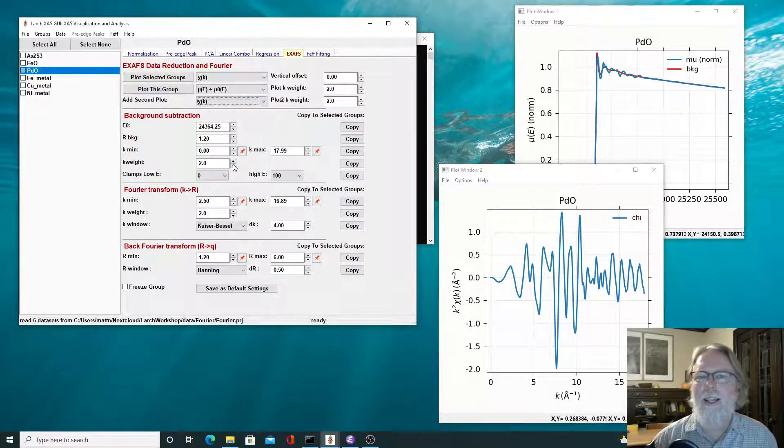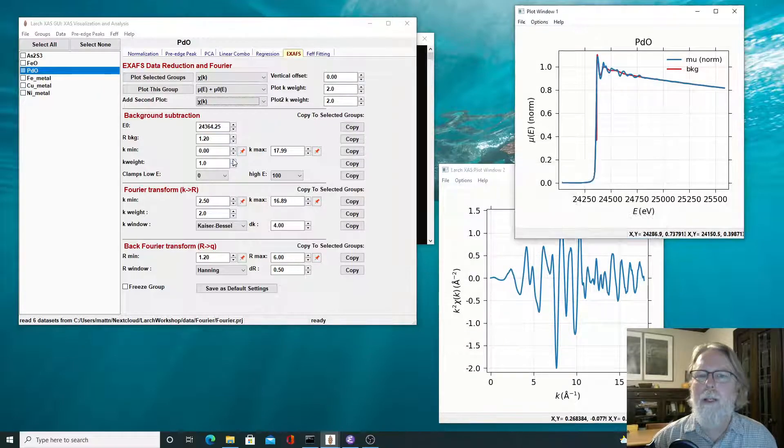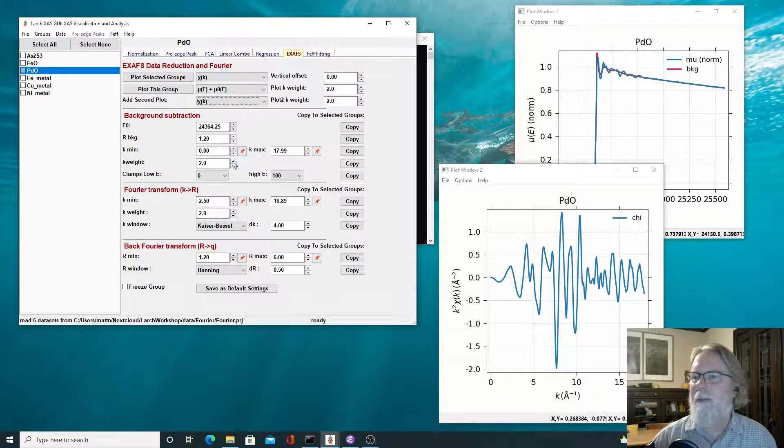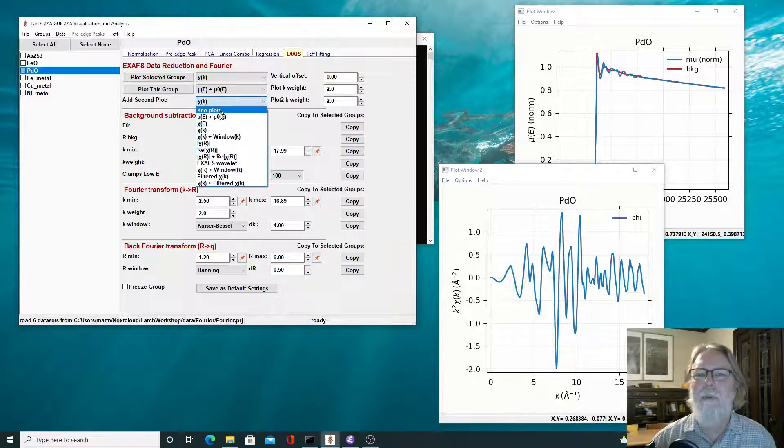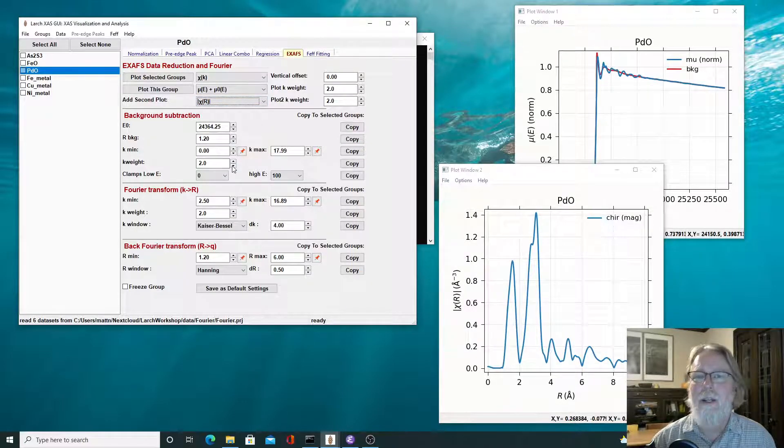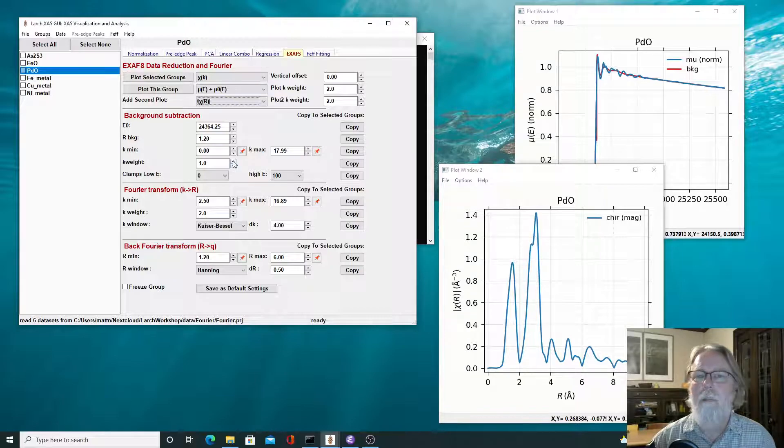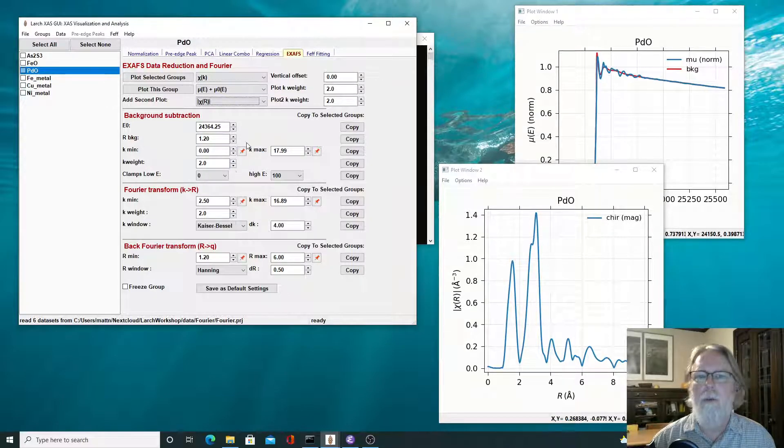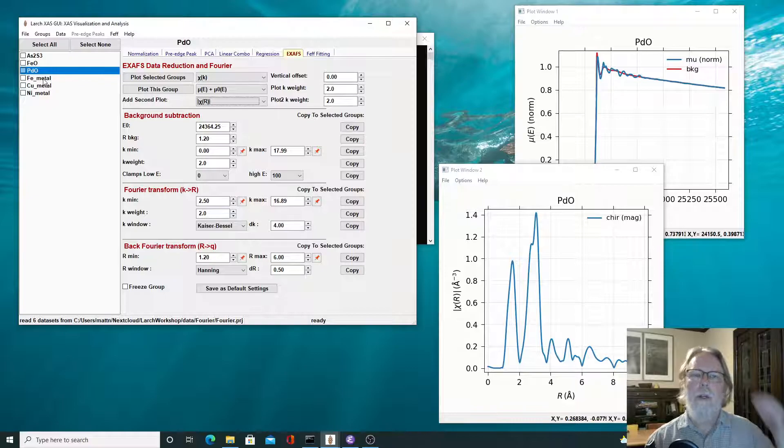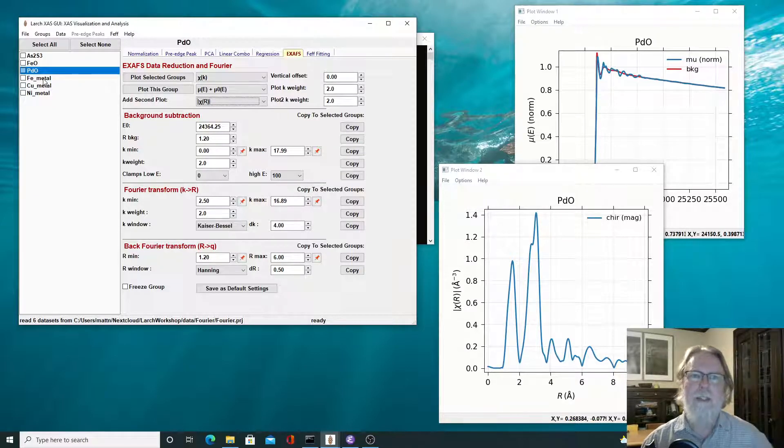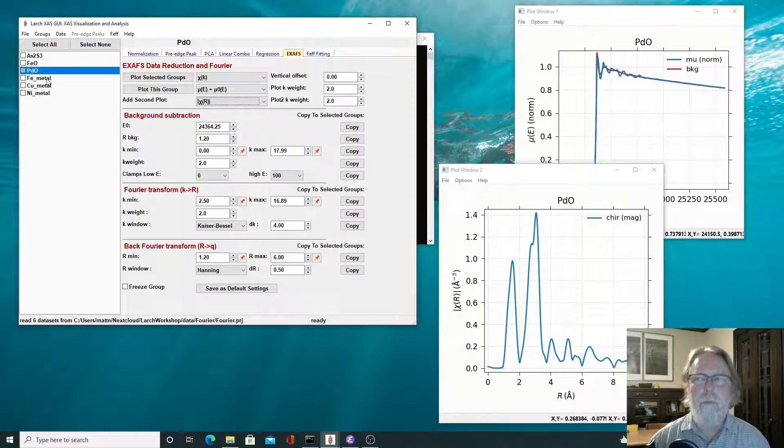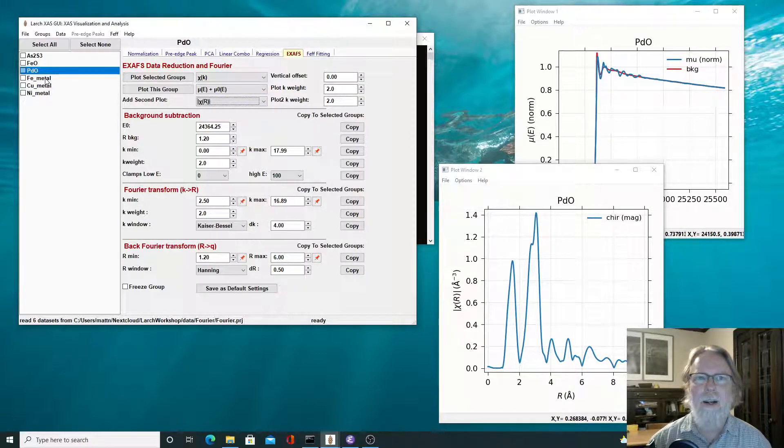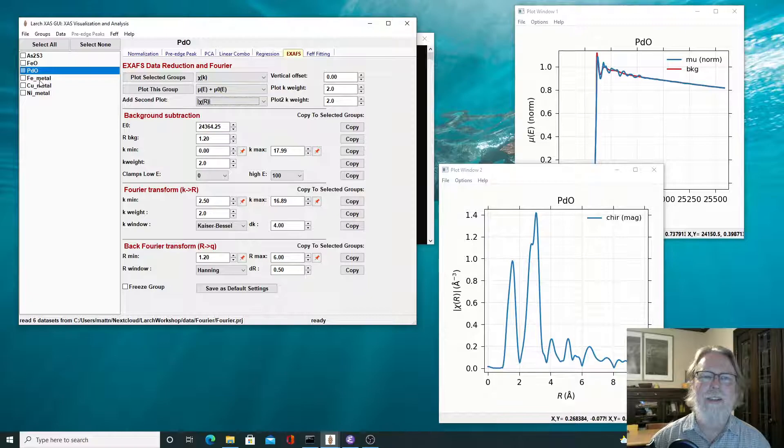Yeah, there is a difference. Which one you like better is sort of a personal choice, I think, at this point. And in R space, it hardly matters at all, which one you use.